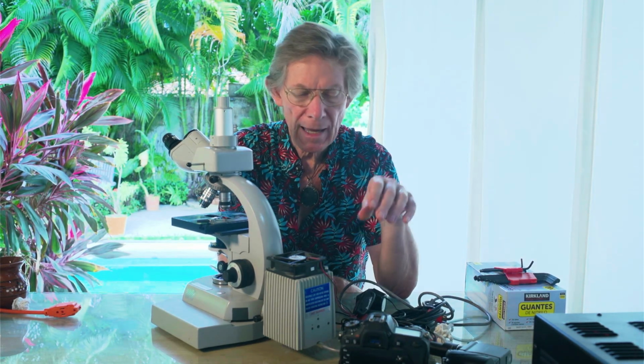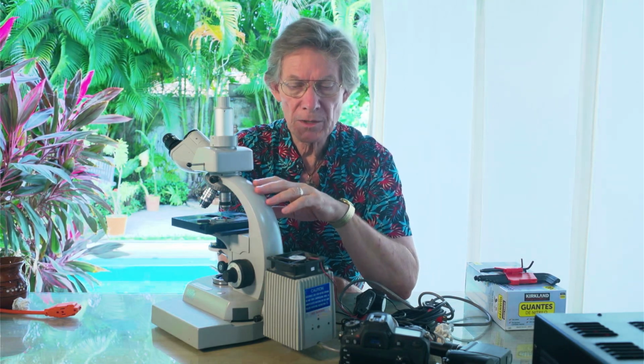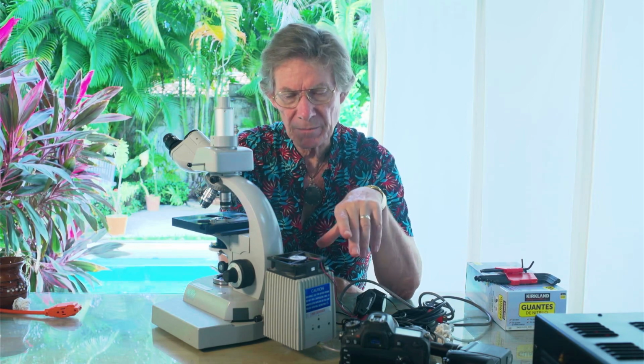Now, this particular microscope has something mounted on the light box right here, which is not normal. This is a thing that was added on the recommendation of the technician at the Zeiss outlet in Toronto, Ontario, many years ago as an upgrade to the system. And the reason we needed an upgrade was splitting the light between the eyepieces and the camera gave us a lower level of light that was not enough to give us really good imaging.